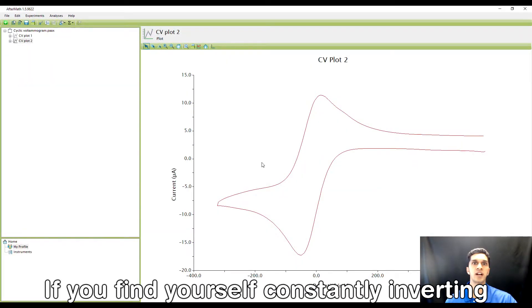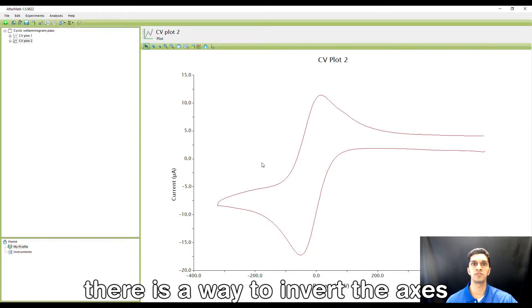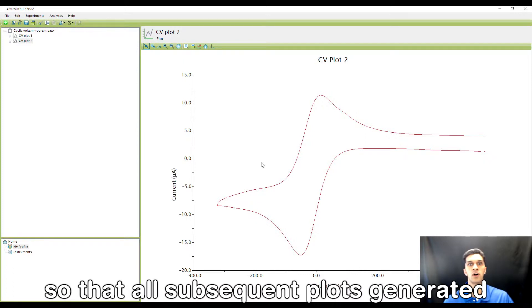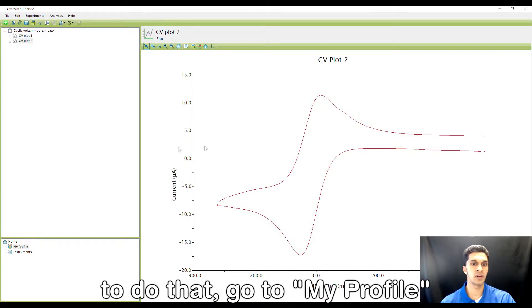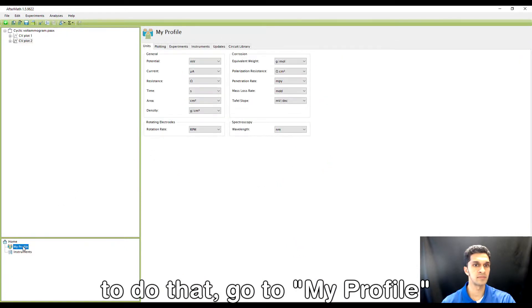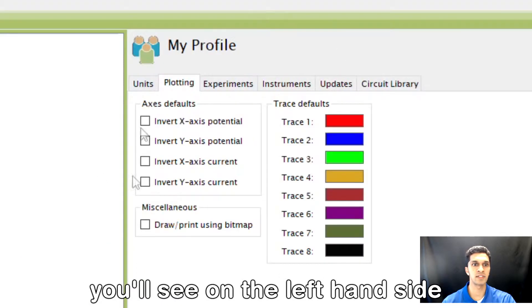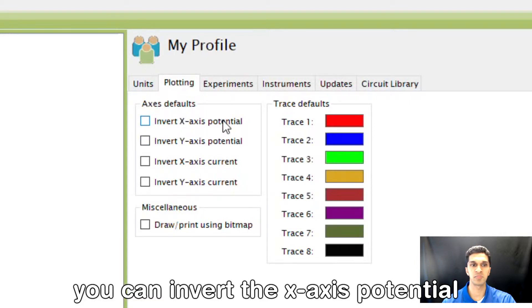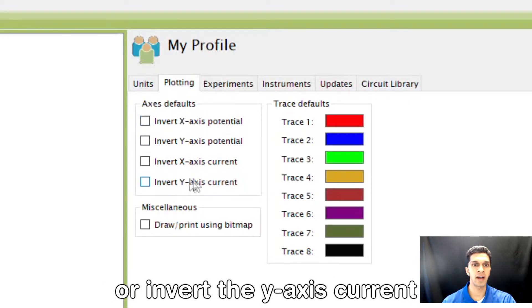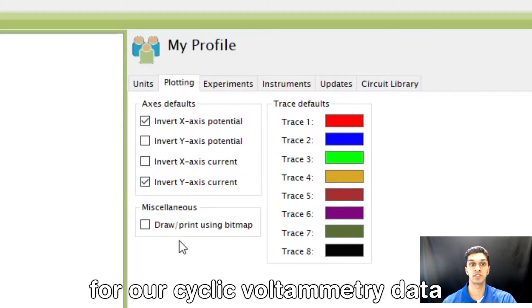If you find yourself constantly inverting the current and potential data in Aftermath, there is a way to invert the axes so that all subsequent plots generated in Aftermath will have the axes inverted. To do that, go to My Profile and then under the Plotting tab, you'll see on the left-hand side it says axes defaults. You can invert the x-axis potential or invert the y-axis current. I'm going to check these two off for our cyclic voltammetry data.